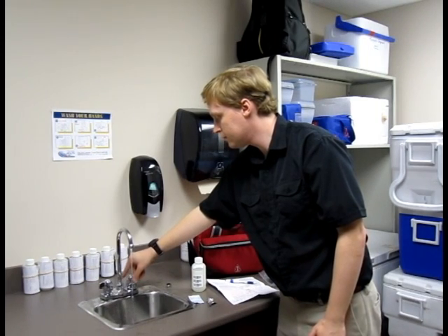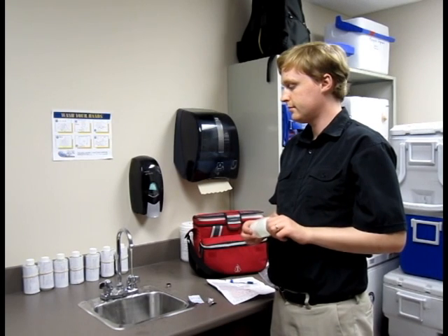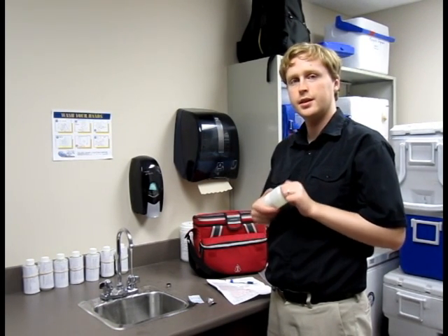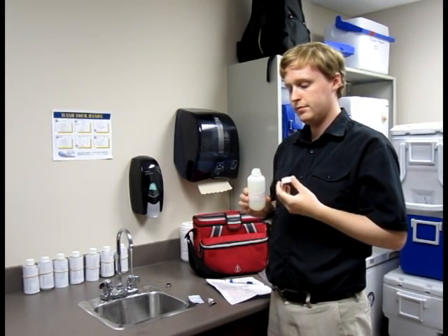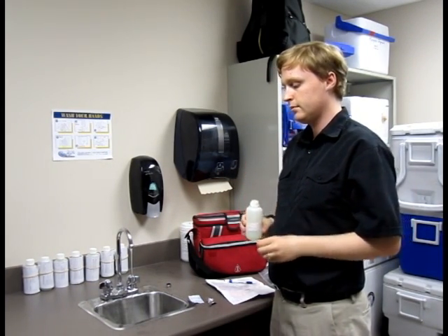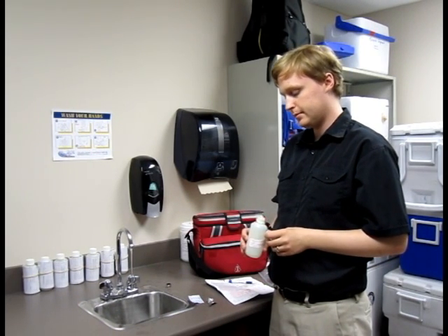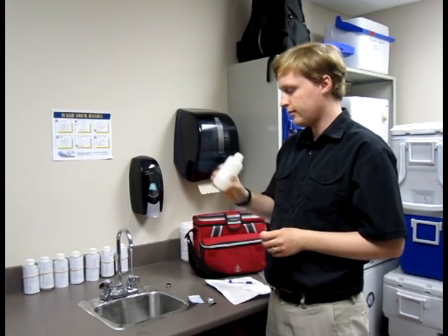When it is time to take your sample, reduce the stream to about the width of a pencil. When you remove the cap from the water bottle, make sure you hear the seal break. Be sure not to touch the inside of the cap and do not put the cap on the counter — it could become contaminated. Do not rinse the bottle out with your water. There will be some crystals or powder in the bottle; this is okay, it is supposed to be there. Fill the bottle up to the fill line.